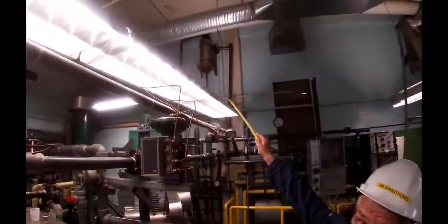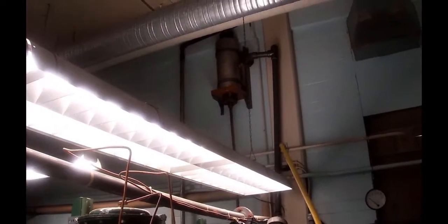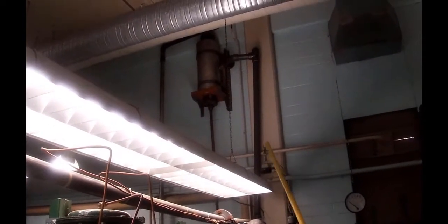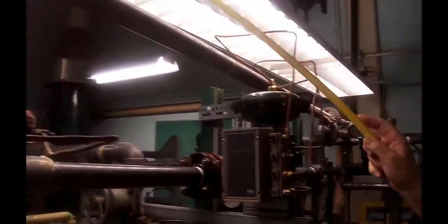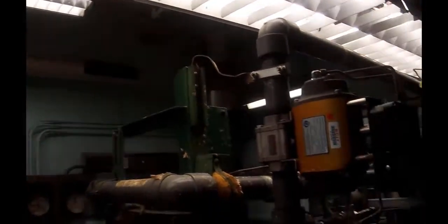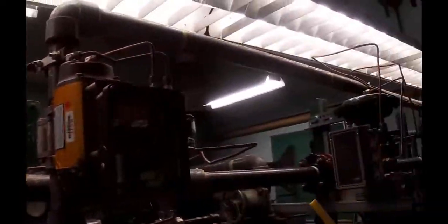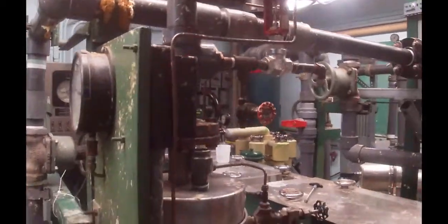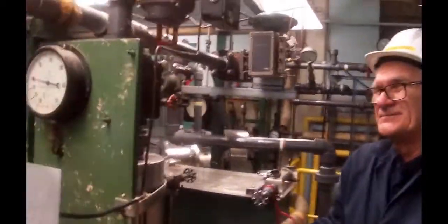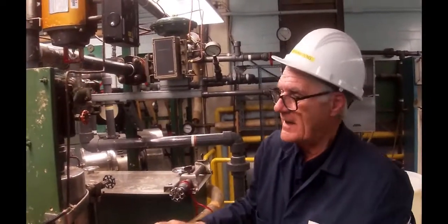Okay. Vacuum will be drawn out here. That tank up at the very top is where the vacuum is sucked. And that line off the right-hand side comes down through this valve and this valve. So this valve is pulling vacuum, this valve is bleeding air in. And we're going to maintain a constant pressure of about 10 kPa, somewhere in that vicinity.